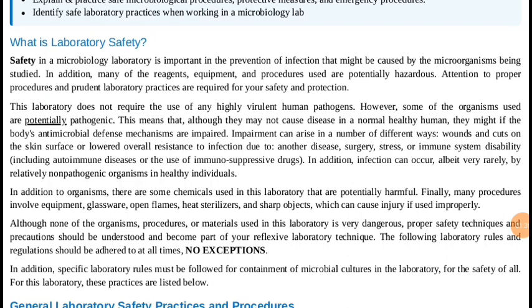That is why it is usually advisable to avoid using highly virulent human pathogens. Use the basic ones, the ones that can be handled. That's why in most school microbiology laboratories, it is usually advisable to use some of the basic and normal flora bacteria.